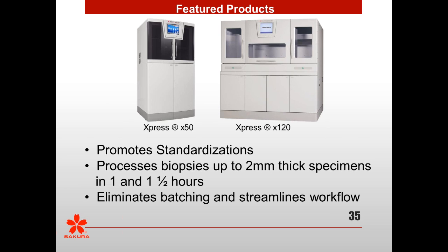So typically you just want to use xylene and your alcohol and then move it forward. The problem is, depending on what the tissue was and what the cause of your underprocessing, you do take the risk of not having a diagnostic piece of tissue. So with the risk of having a sample that is no longer diagnostic, and it may be an irreplaceable tissue sample, spend more time making sure that you have thin, consistent tissue samples and accurately fixed before you ever move to processing.